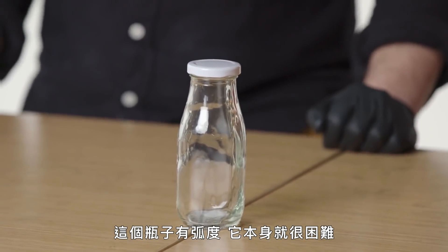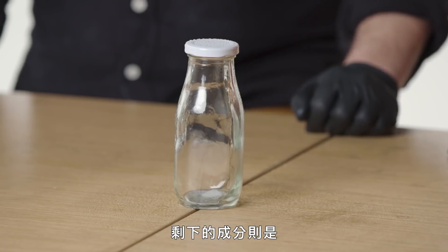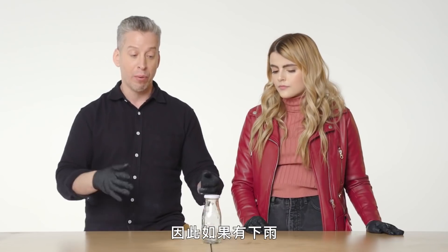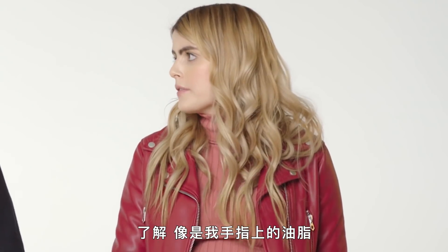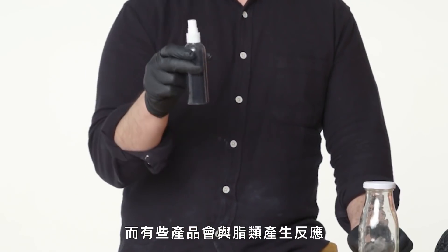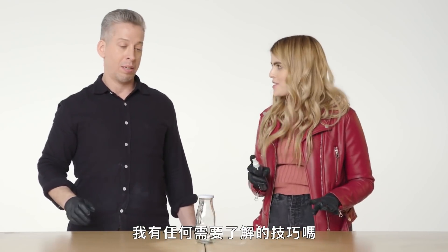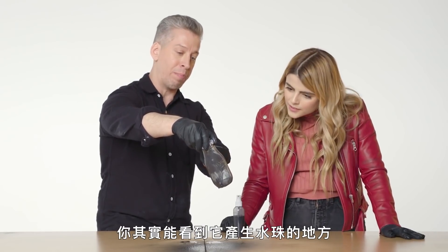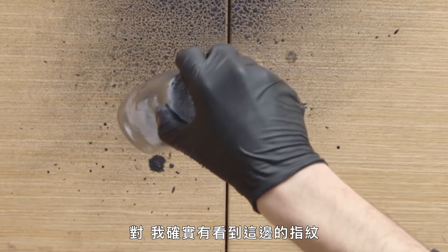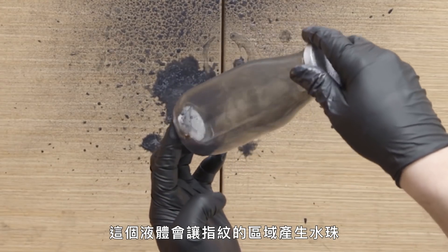This bottle is curved, which is difficult to begin with. Let's make it harder — let's say it rained the night before. Fingerprints are comprised mostly of water, with the remaining percentage being minerals, salts, amino acids, and lipids. So if it rained, that 98% of the fingerprint is gone. But what remains could be the fatty part — the oils from your finger. Sebaceous glands secrete oils, and there are products which react with those lipids — a suspended solution of molybdenum disulfide that reacts with the fats in your fingerprint. Start at the top, work your way across and down, and completely coat the surface. You can actually see where it's beading off — that reaction between the two.